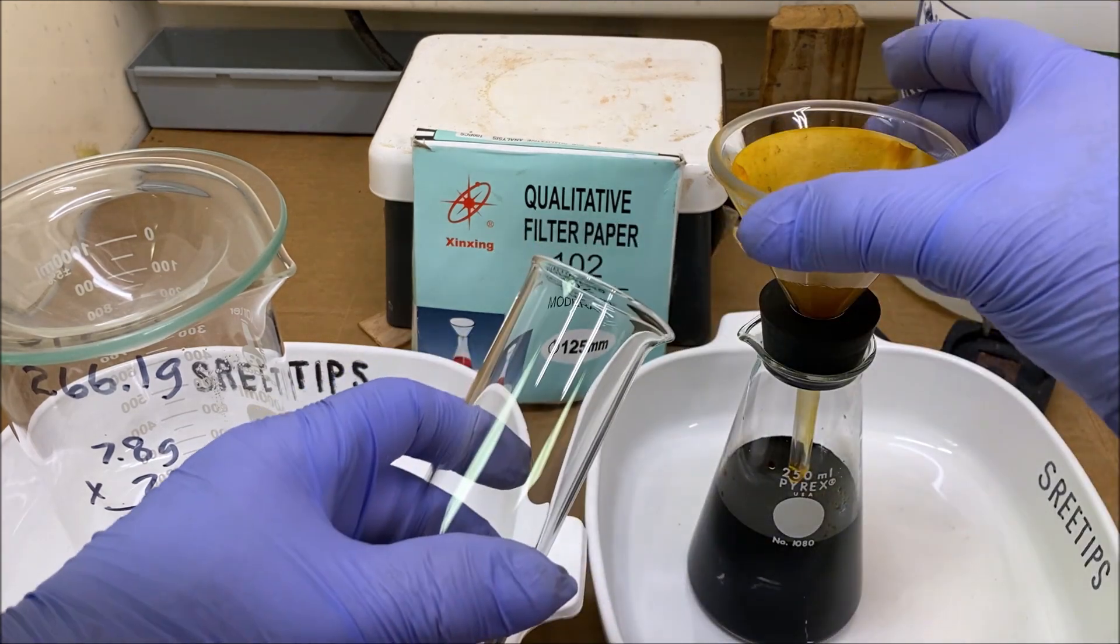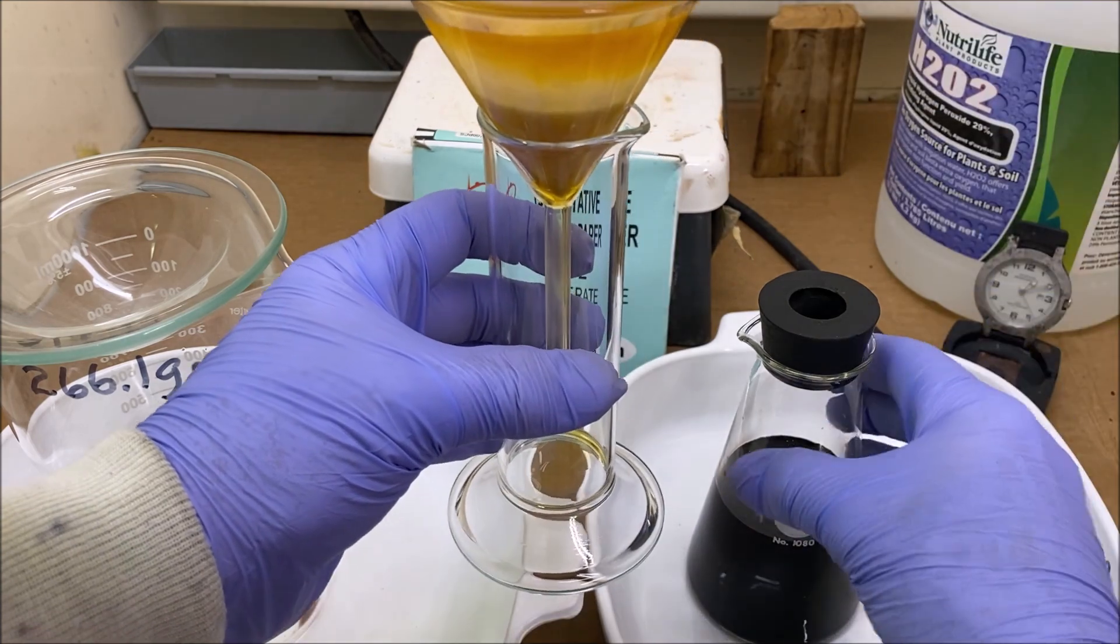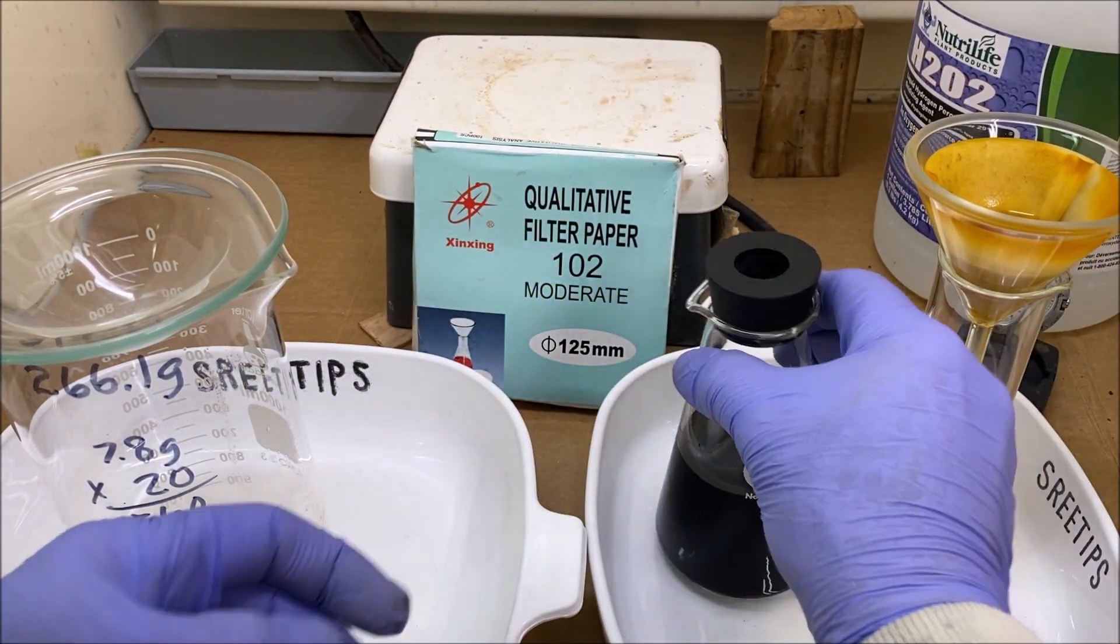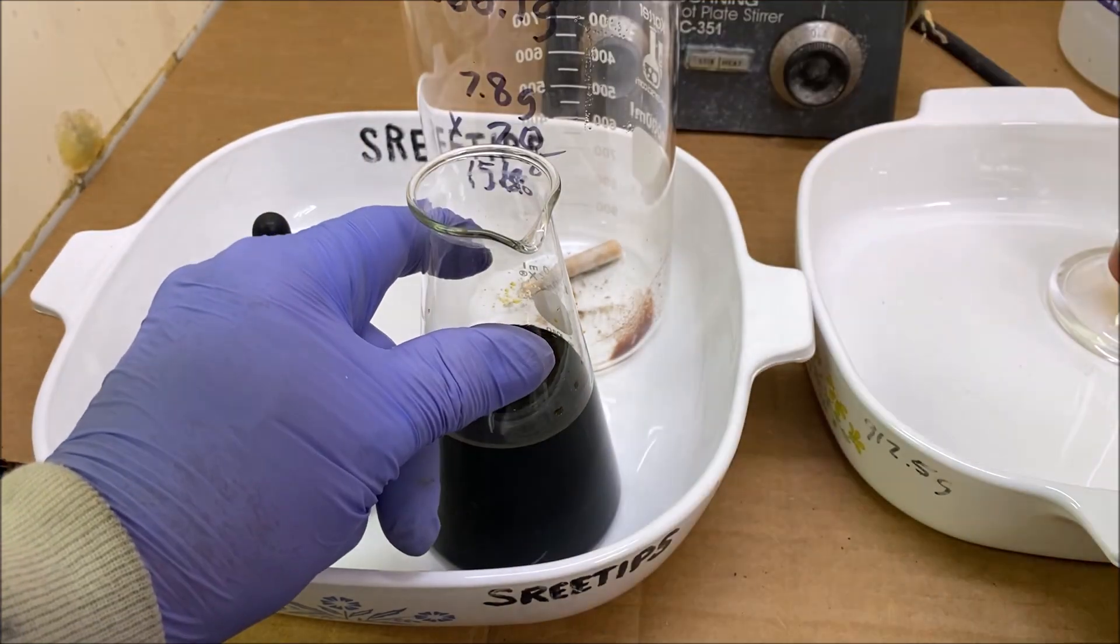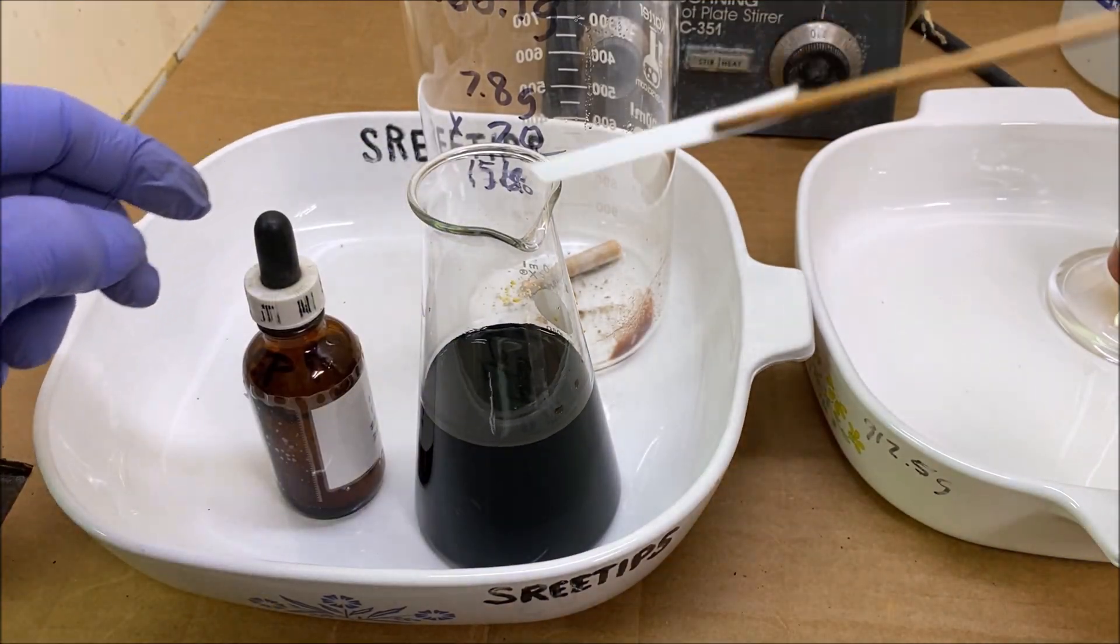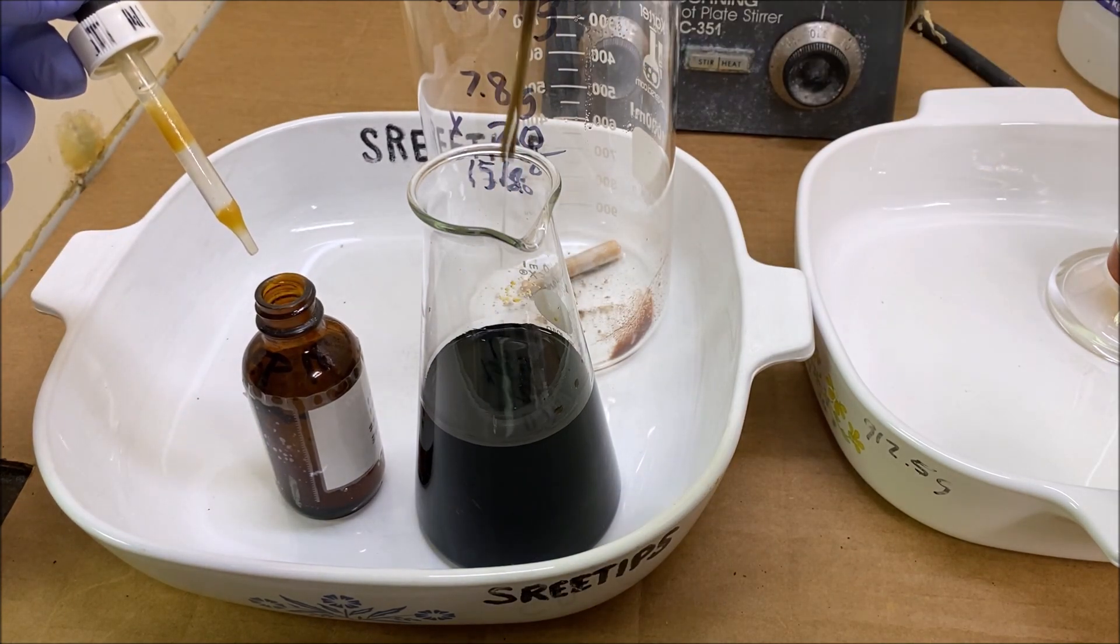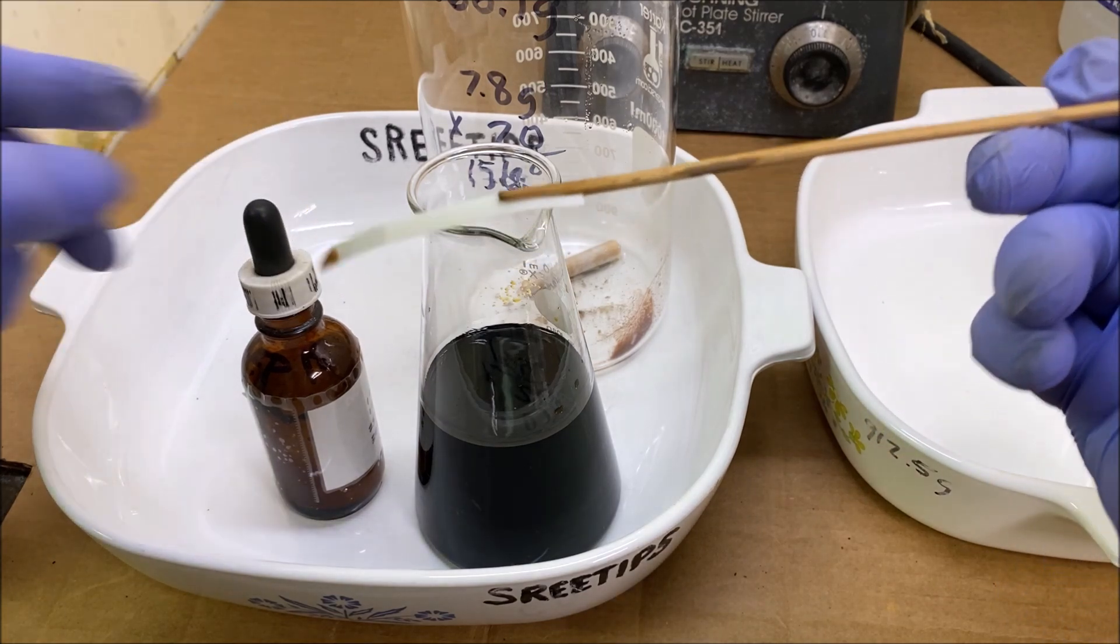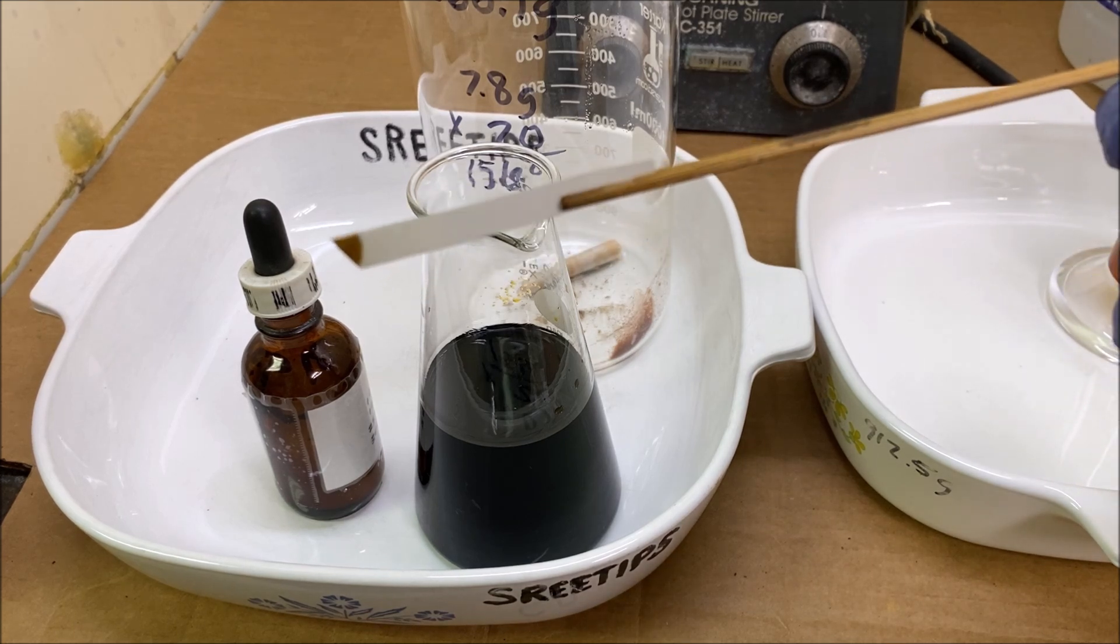I'm going to take this funnel off of here and put it in this little container, and this will be our main solution now that we'll be working with. I'm going to get a little of this solution on a piece of filter paper. I'm going to test this with stannis, and you see I've got a very dark stain going on there, between orange and brown.